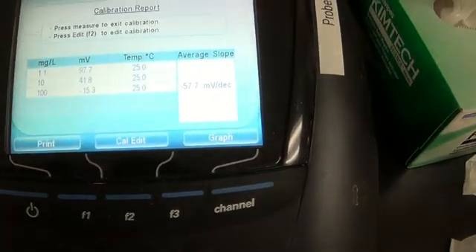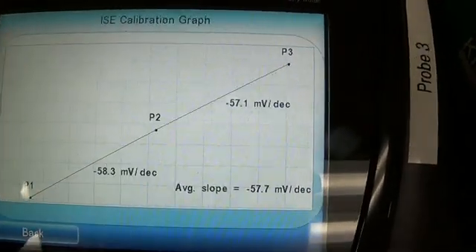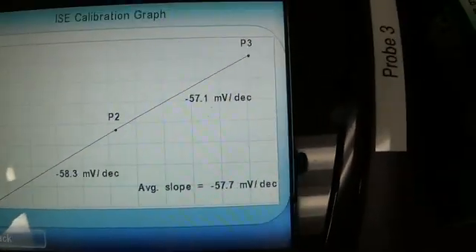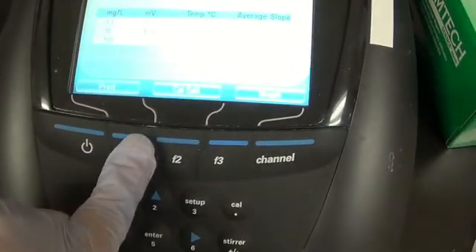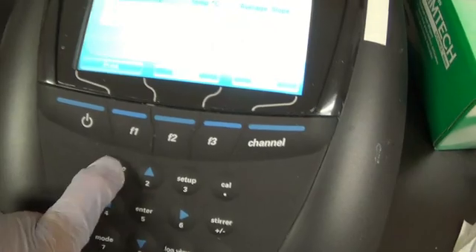Let's take a look at the graph to see what it looks like. That's beautiful. Perfect straight line. Just what we want. Let's go out of here. Back. Escape.